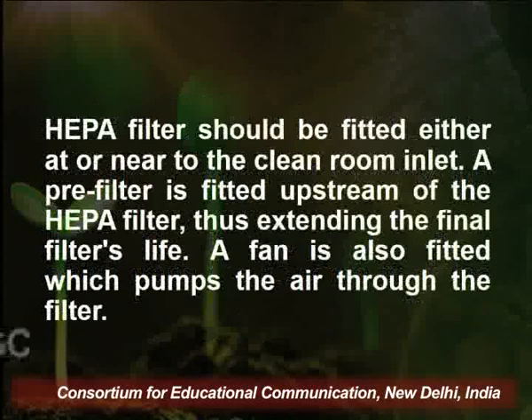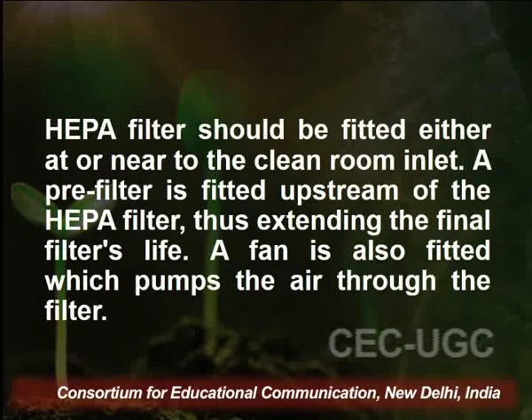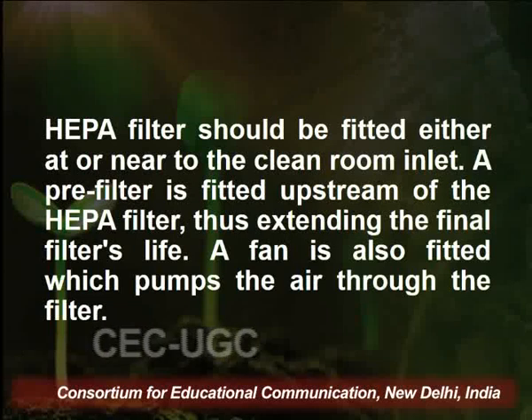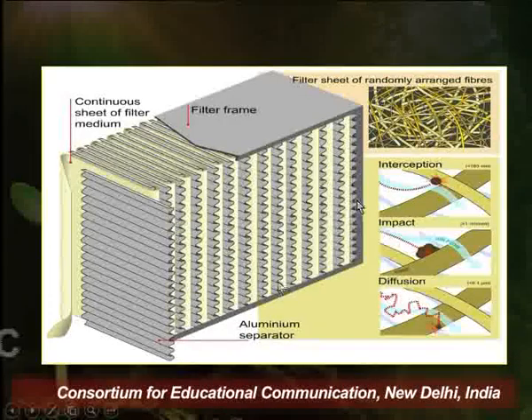HEPA filter is a particulate filter which traps the airborne particles and microbes, but it allows the gases to pass through. So the HEPA filter should always be fitted either at or near to the clean room inlet. A pre-filter is fitted upstream of the HEPA filter, thus extending the final filter's life, and a fan is also fitted which pumps the air through the filter. So let us see this HEPA filter and the arrangement of filter with the help of a diagram.